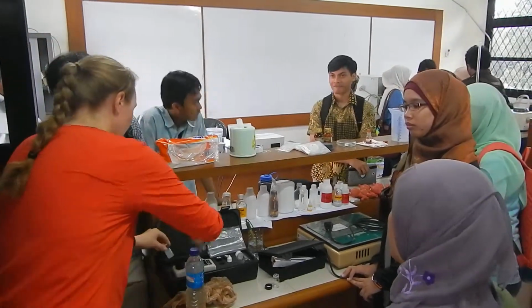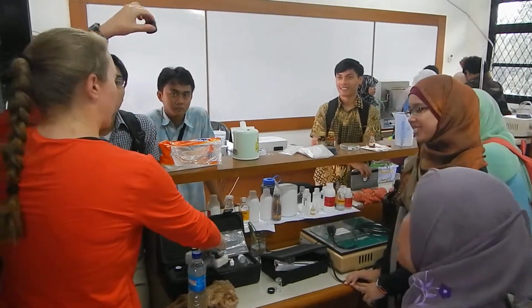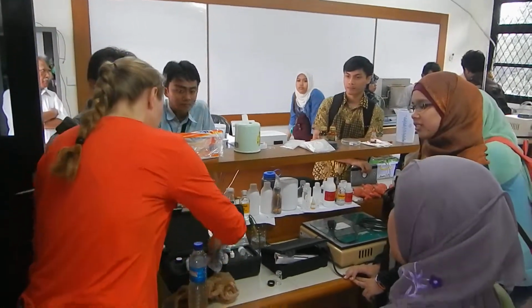Okay? The other important thing is, on top of this, you're going to see a black cap. It's very important because this sensor is reading light, so you don't let more light get in, because that's going to change your reading, okay?